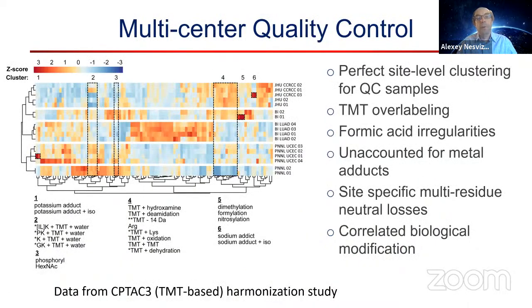You could also use it for summarizing PTM results across multiple experiments. So PTM-Shepherd can generate a multi-experiment report where it will compare PTM profiles from different experiments, and you can visualize them as heat maps and see if you have a particular experiment where you have a lot more adducts due to sample handling, or if there is a biological modification that for some reason is particularly enriched in one set of experiments, and so on and so forth. So we also illustrate that application in the PTM paper as well.